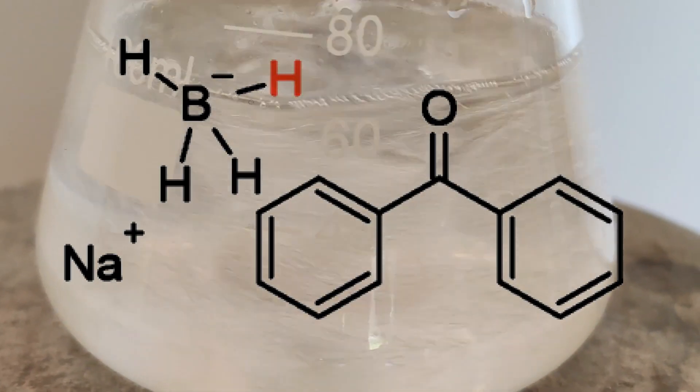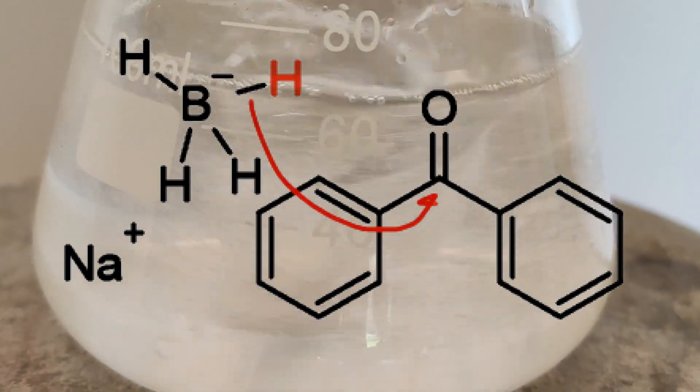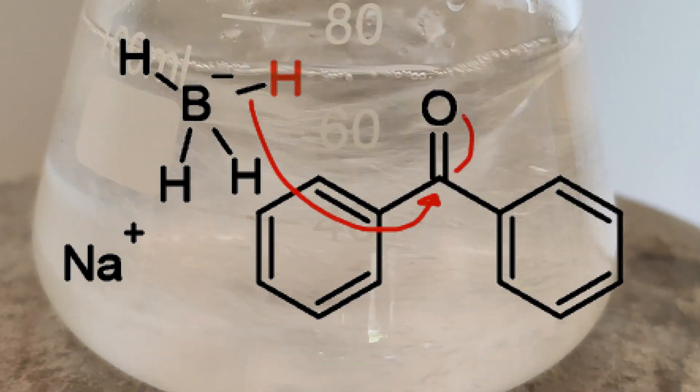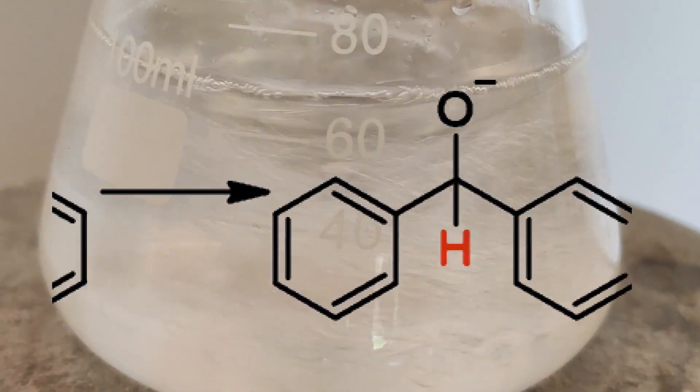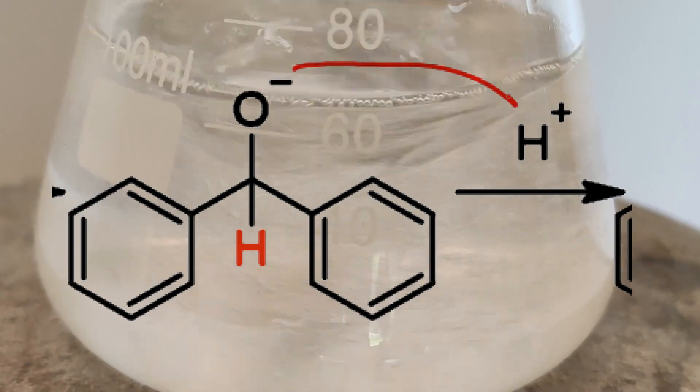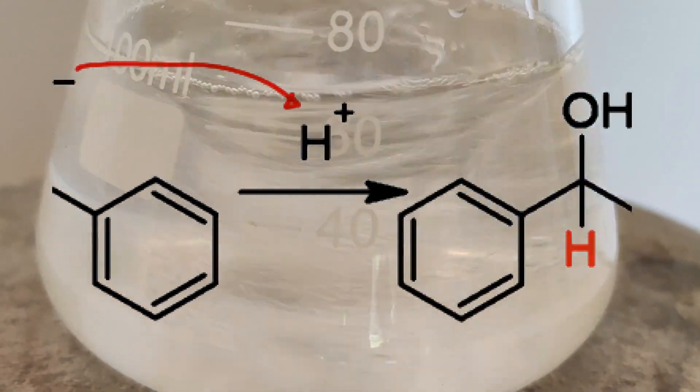This reaction is a simple carbonyl reduction. The hydride of the borohydride anion adds to the carbonyl carbon of the benzophenone, forming an alkoxide that is then protonated to yield our final product, diphenyl methanol, also known as benzhydrol.